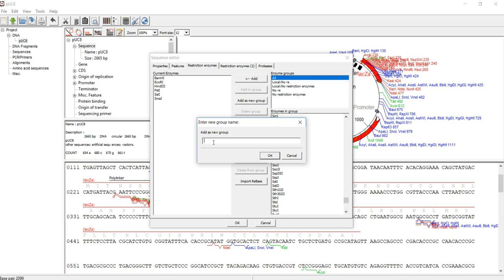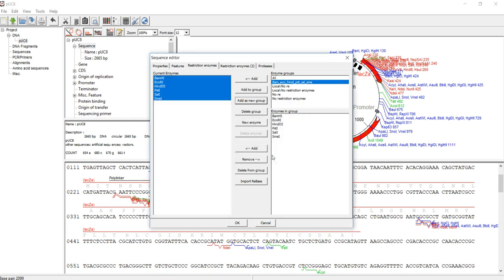Maybe I'll just put 'Bam and Eco and Hind and Pst and Sal and Sma'—whatever name that is convenient for you. After that, you just click OK. You just click OK and it will be saved. You will see this is a group of enzymes and it's going to be useful.